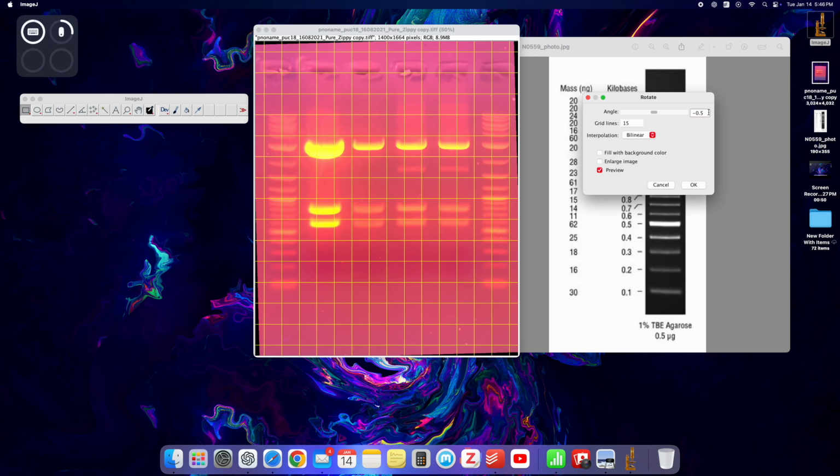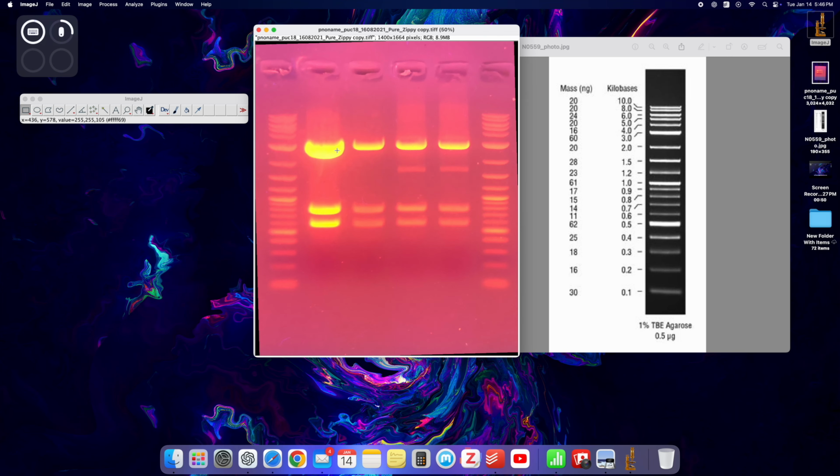I think this is about right, or not. Okay, let's say that this is the way to go. I would presume this is actually pretty straight right now.